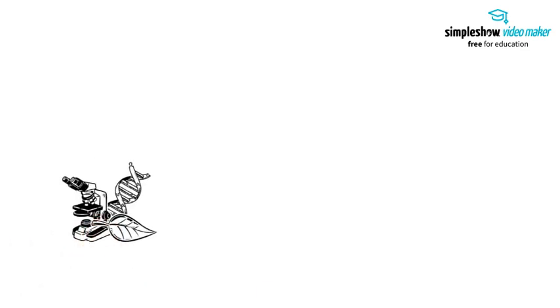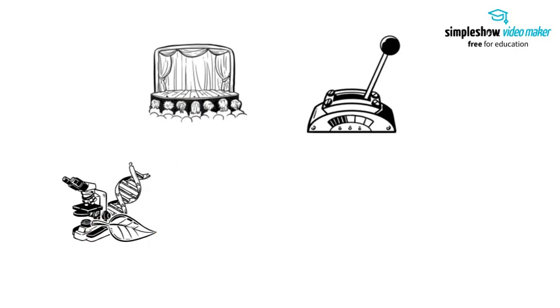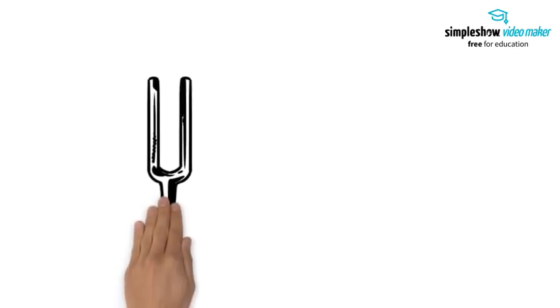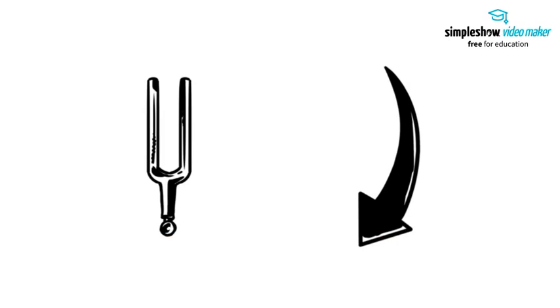Using a compound microscope begins with placing a slide on the stage. The coarse adjustment knob brings the image into general focus. Fine-tuning occurs with the fine adjustment knob. The viewer peers through the eyepiece, observing the magnified world on the slide.